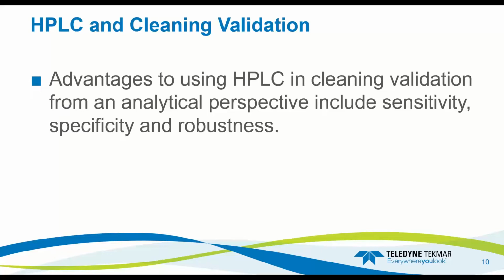But if there is an unknown and you don't have a mass spec or you're using a UV vis and there's an unknown peak, well, it's going to take you some time to figure out what that unknown might be. Well, when we start looking at TOC, TOC is a catch-all. It's going to get everything for us.